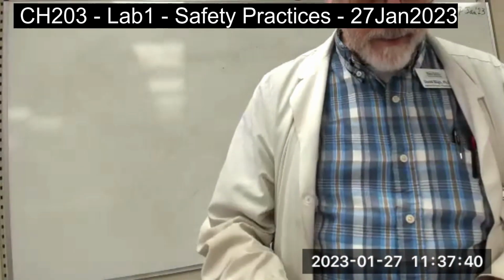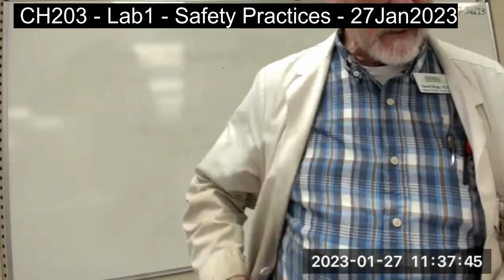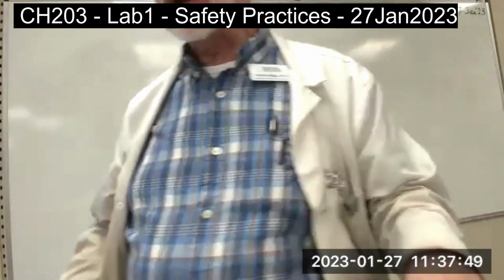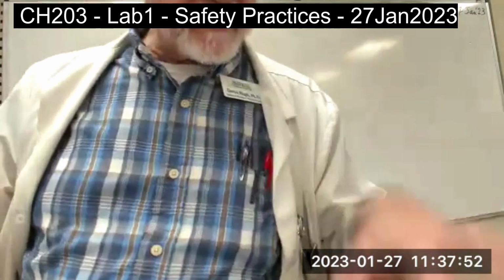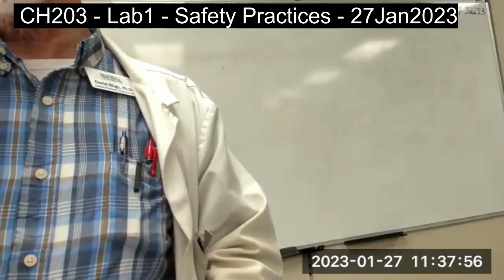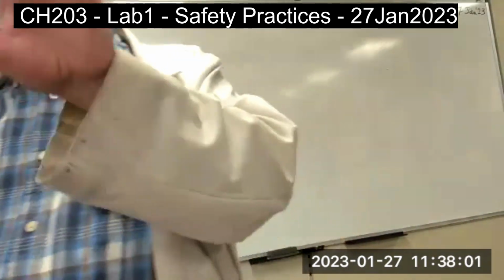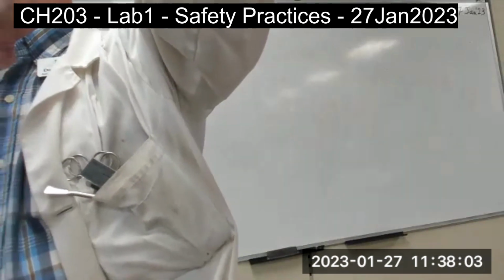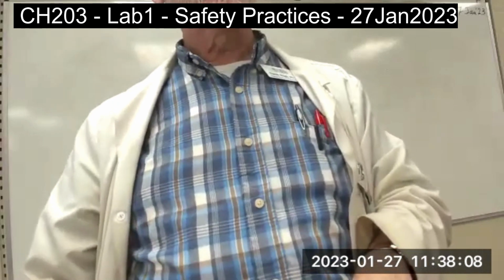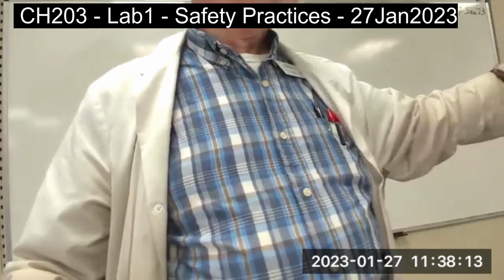Okay, we talked about stop, drop, and roll. Safety information. Where's the shower? Right. Yeah. Okay. So in order to put it in this format, I've got this arrow on that table facing north. That's north. So this would be the northwest corner of the room, would be the shower. Fire exits, northwest corner, southwest corner.